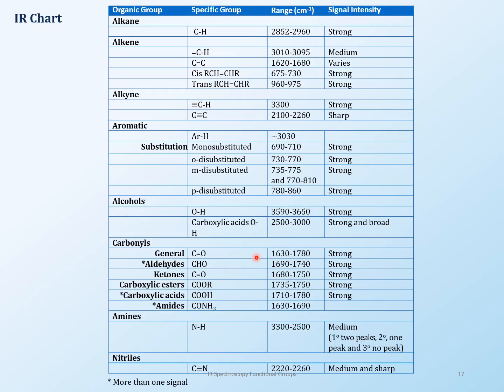And here is a chart. You're most welcome to use this. You can print it out and use this. I have given here for the substitutions what you see in the fingerprint region, in case you need it. But again, we talk about it in the lab.